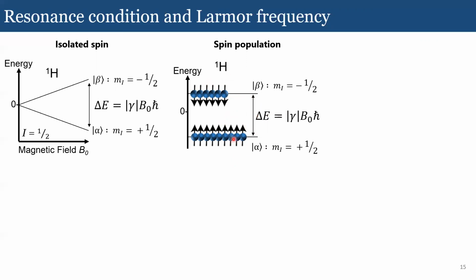That difference in population in the states is actually quite important, and the reason is that this is what NMR is playing with.